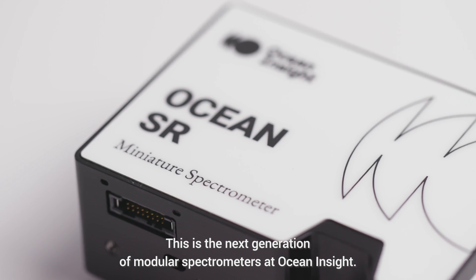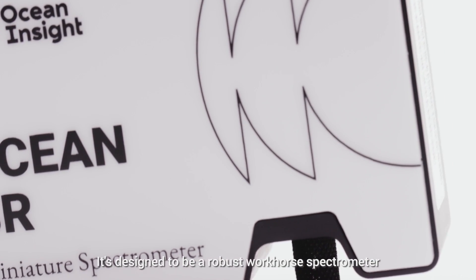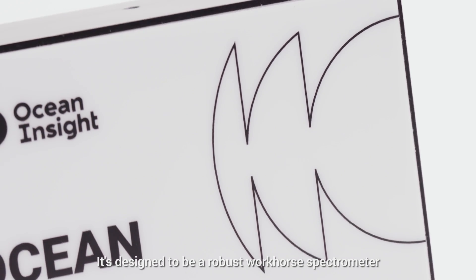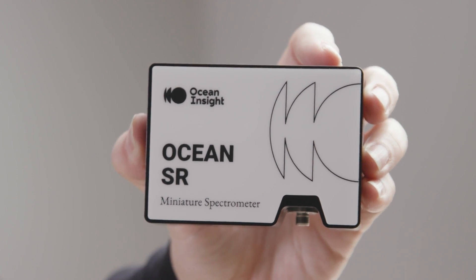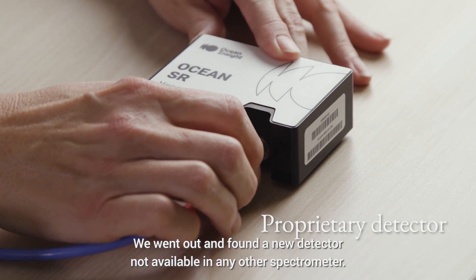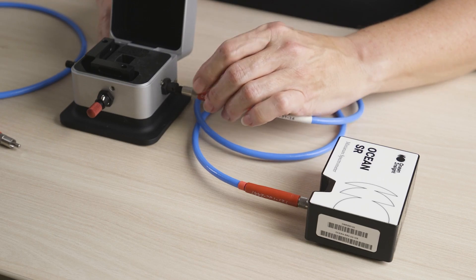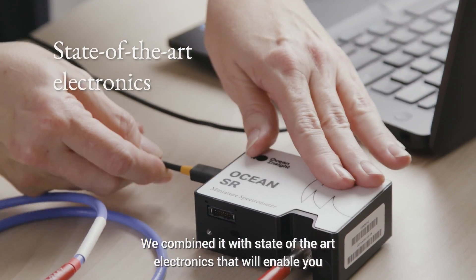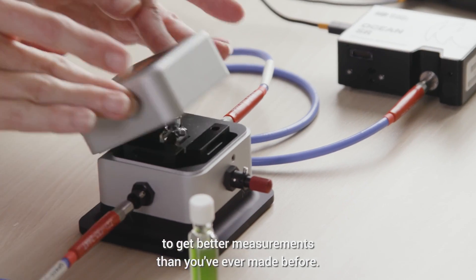This is the next generation of modular spectrometers at Ocean Insight. It's designed to be a robust workhorse spectrometer that can fill many different types of applications. We went out and found a new detector not available in any other spectrometer, and combined it with state-of-the-art electronics that will enable you to get better measurements than you've ever made before.